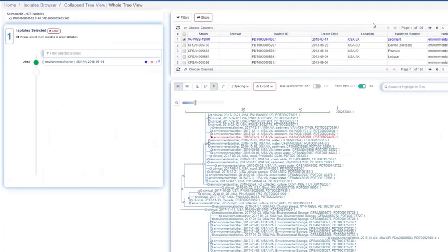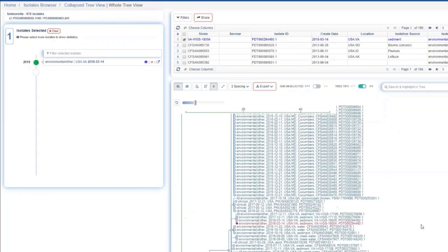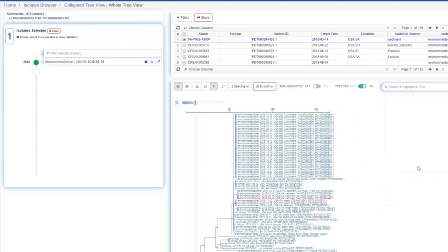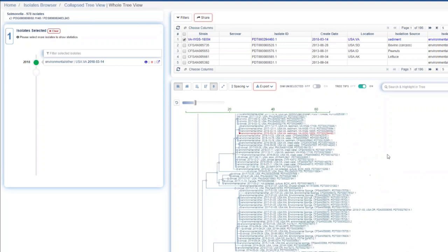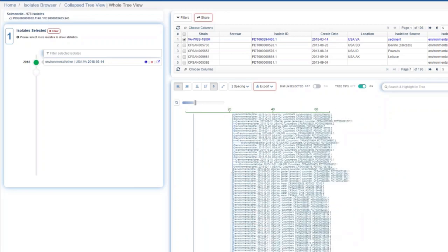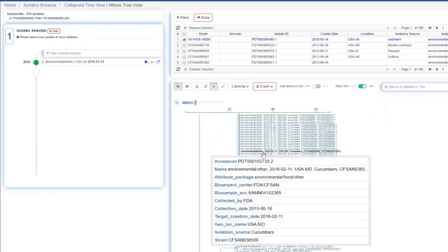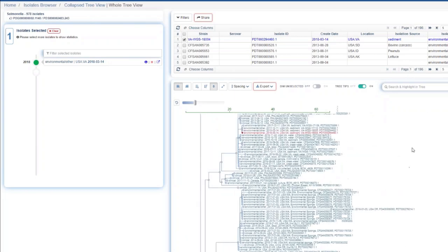Not only do we compute SNP distances, we actually provide this in a phylogenetic tree. I'm going to open that up — this is what we call the isolate tree viewer, or SNP tree viewer. We have three panels: a navigation panel, a table with all the metadata, and the phylogenetic tree. It's like Google Maps — you can pick it up, drag it, zoom in, and zoom out. This isolate is in a SNP tree of 978 Salmonella isolates. You can see parts of the tree that are very closely related and other parts that are more distant.